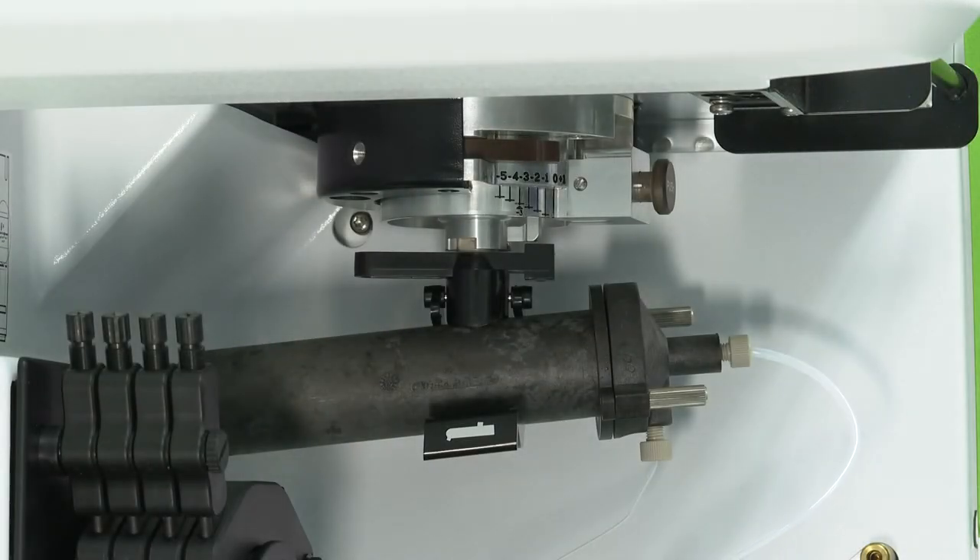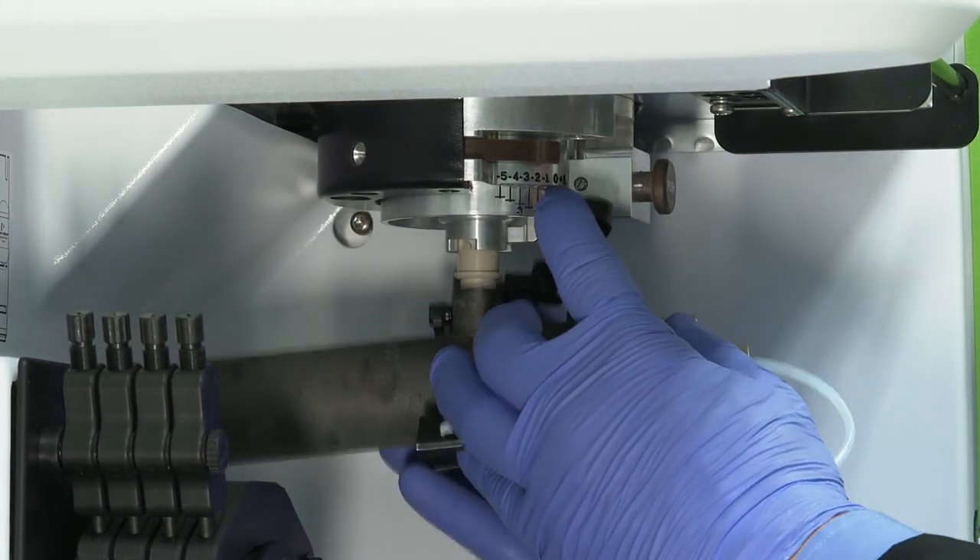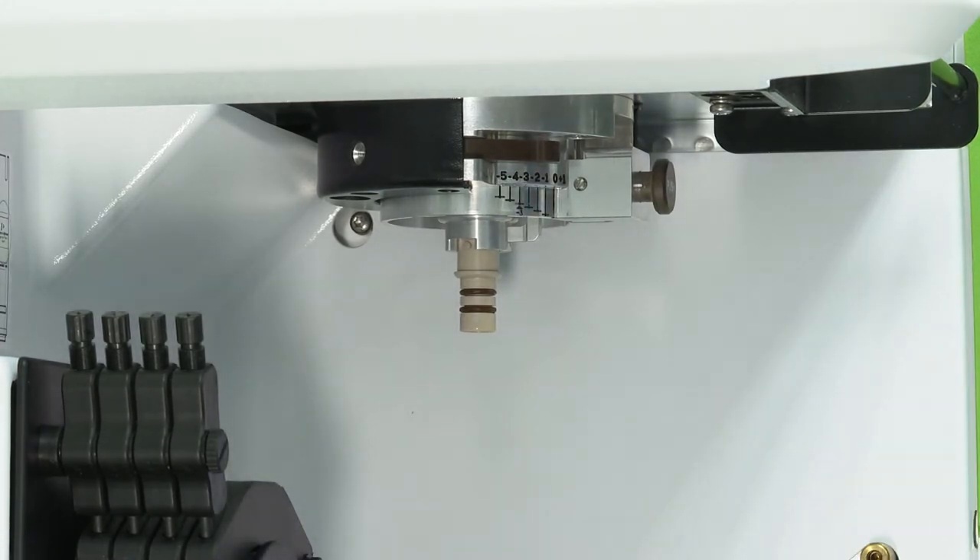If a Scott spray chamber is installed, release the spray chamber clamp and slide the Scott spray chamber downward to separate the chamber from the injector support adapter.